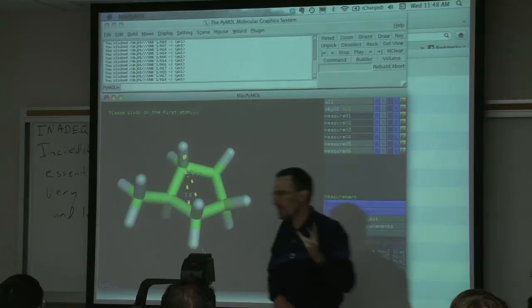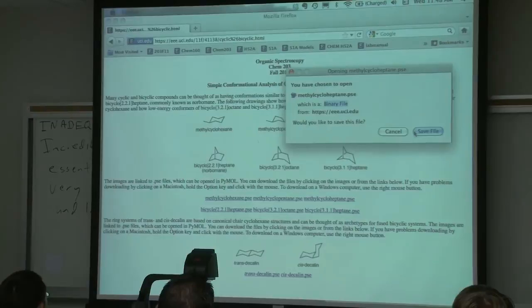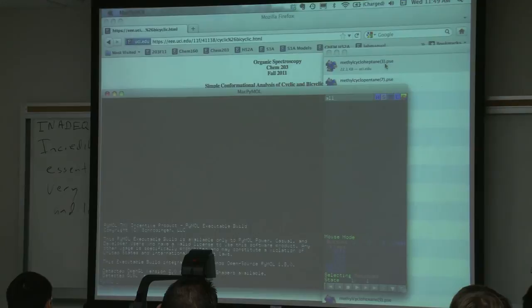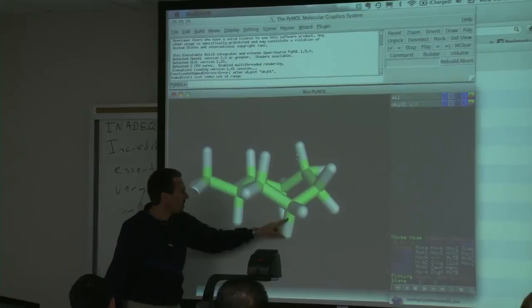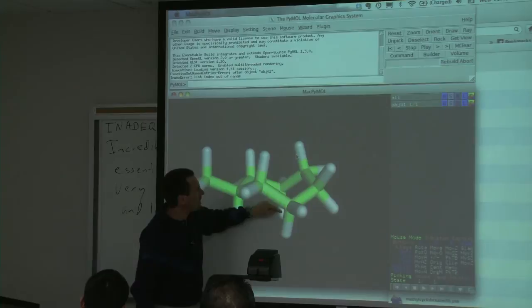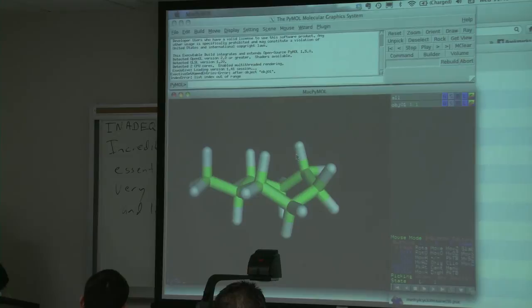All right, I want to show you at this point a seven-membered ring. Seven-membered rings, as I said, can have different conformations, but often you're going to find a conformation that's very similar to this canonical cyclohexane. You notice you have three hydrogens that are basically axial, and three that are basically axial here. I've put the methyl group equatorial on the ring. So you can start to see that all those things I was thinking about, like a big J between these hydrogens, or a close contact between these hydrogens, are going to apply. The other family I thought was really useful is our norbornane structure.